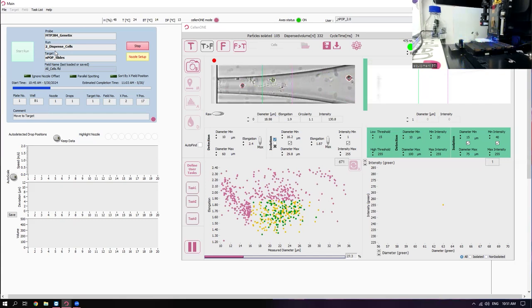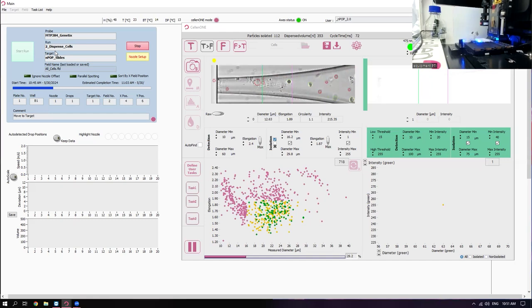Yeah. So as you increase the concentration of either DMSO to water or water to DMSO, it just kind of falls off. It's quite a broad range. I was really surprised when I first saw it. Hydrogen bonding, I don't know. It's a pretty wild mixture.